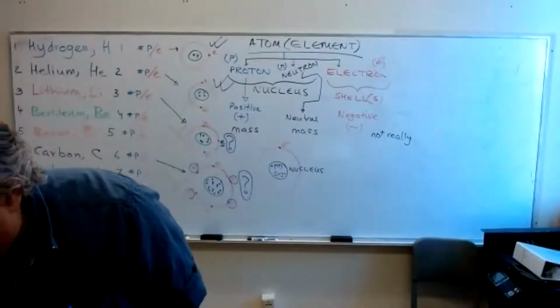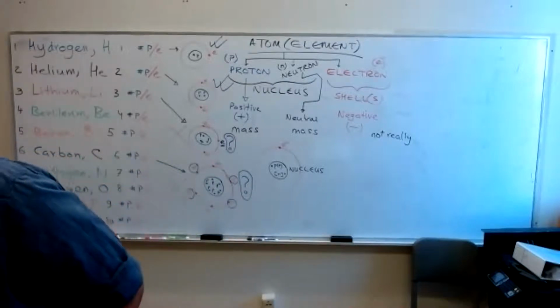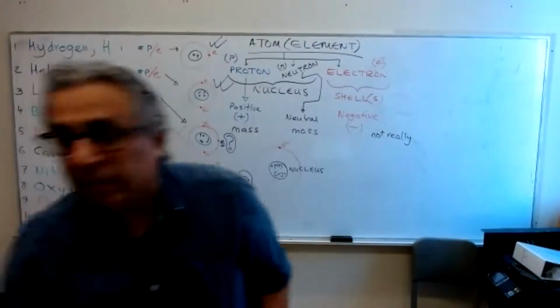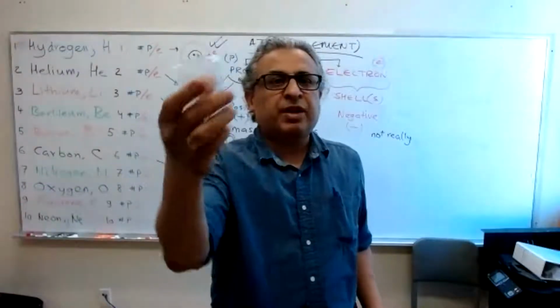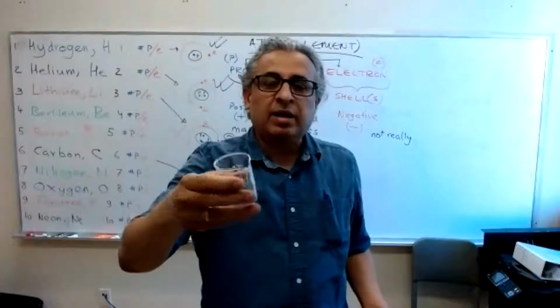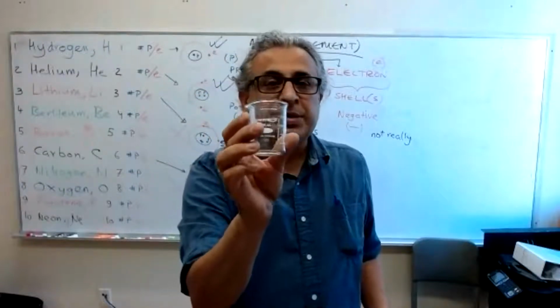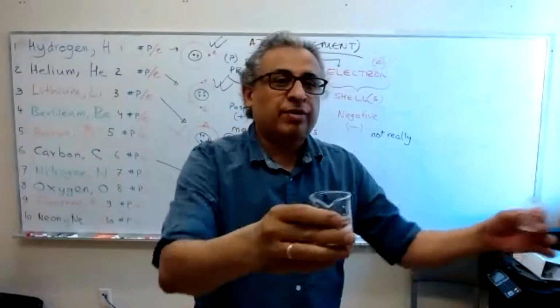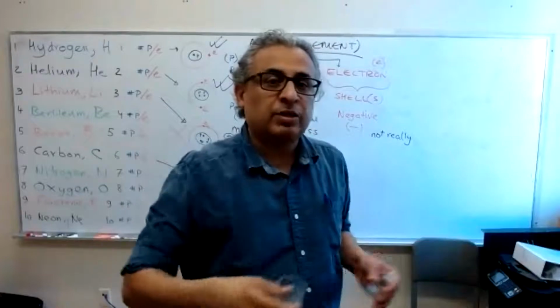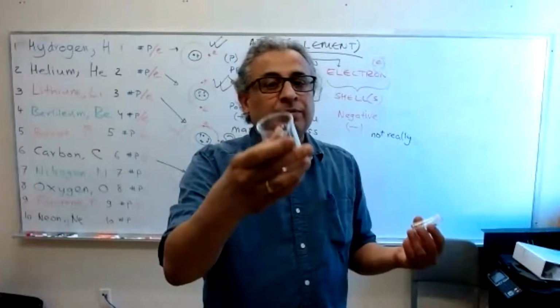You saw the clamps. Where is the beaker? The simple old-fashioned beaker. There is a beaker. That's a 100 ml beaker, just for transferring liquids and stuff like that. If you want to keep some distilled water, acetone or methanol around, because maybe you and 3 other people at that workstation want to use and share, you can.